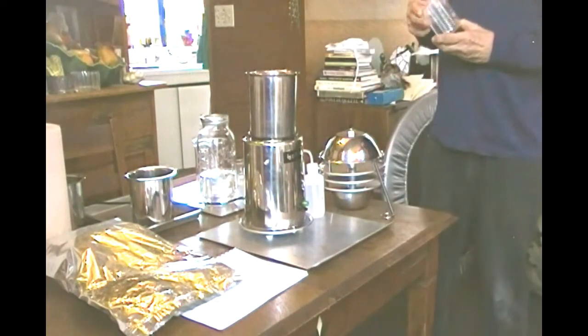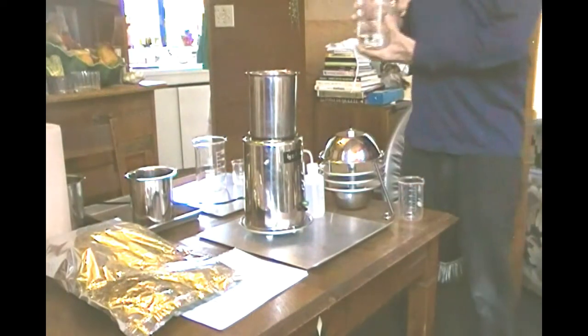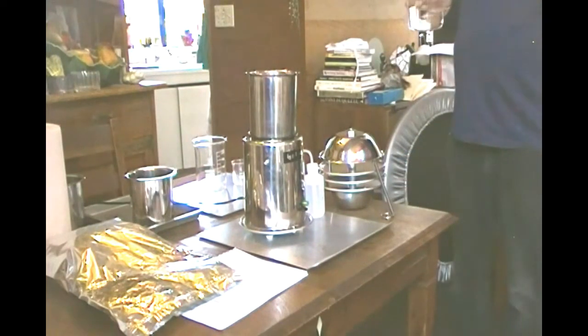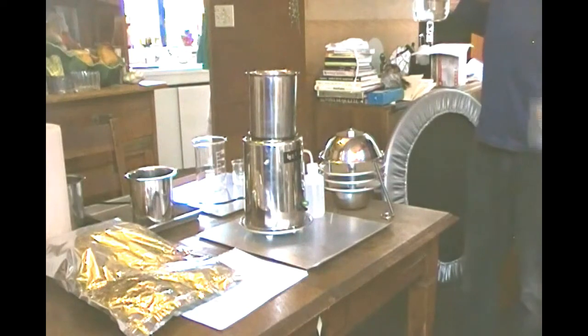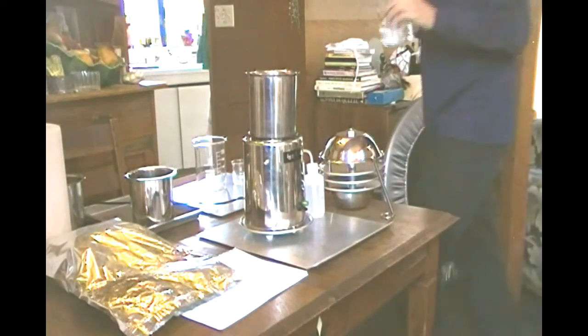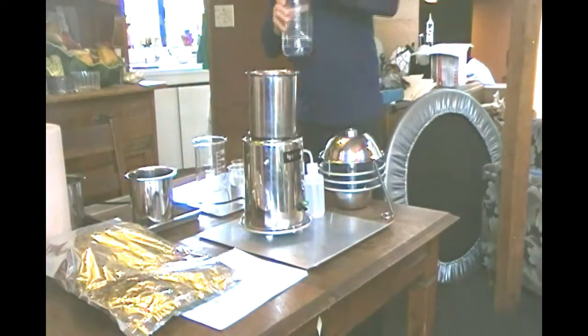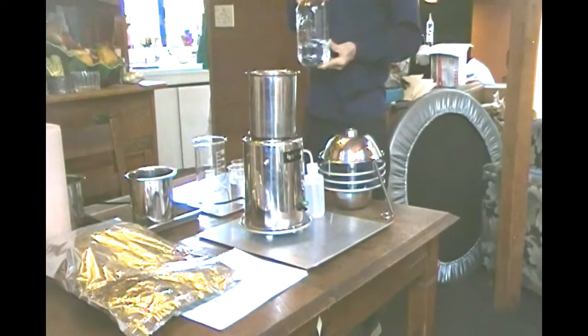Now what we want to do whenever you're working with ethanol, you don't want to just pour it into here, and you don't want to open the ethanol and do your pouring in any proximity to a stove or a pilot light or anything like that. So your best bet is to go to an area which is remote from where you're working and pour your ethanol into one of your beakers. I'm going to the sink to pour the ethanol. And I'm going to take the ethanol that we're using and store it away from the operation in its sealed bottle.